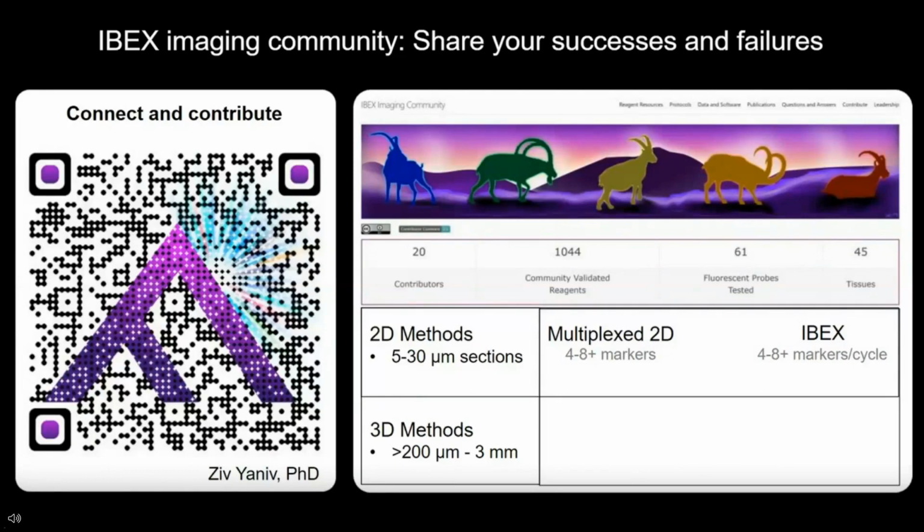So those are the larger volumes, which I showed you in that video that you played earlier, where you can go from 200 microns to 3 millimeters. So there's the clearing enhanced 3D imaging method developed by colleagues in the Germain lab that allow 4 to 8 markers in one image. And then there's the C3D Ibex, which is underway and developed by Hiroshi and Mondo and other colleagues in the Germain lab, where it applies C3D and Ibex to do more markers in the total volume, about 15 markers. So that's very much underway. But this is what you can find in the Ibex imaging community, along with now also the integration of the Ibex cell dive or cell dive Ibex.